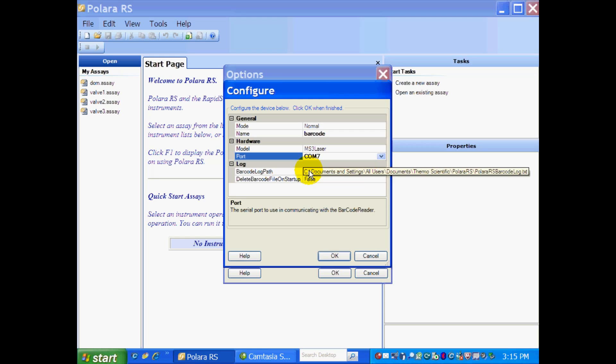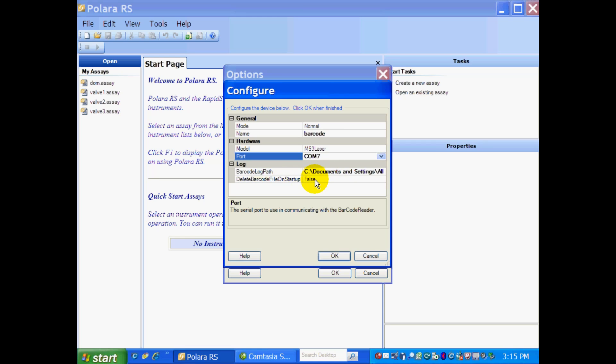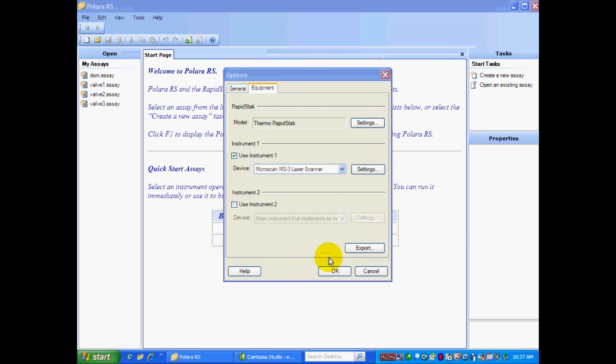The barcode path is sort of preset here. If you'd like the log files to go elsewhere, you can select that. And delete barcode on a file startup, I have it as false. And that's what you want. And you hit OK.